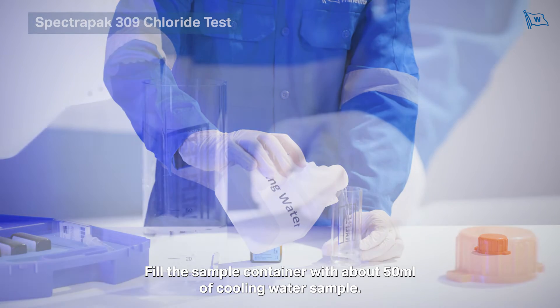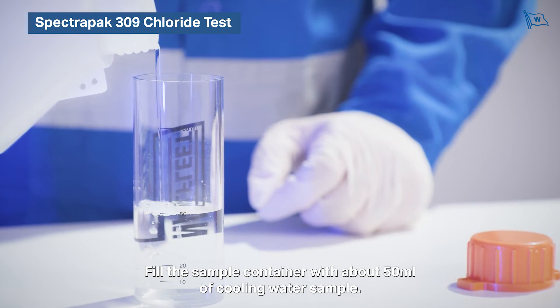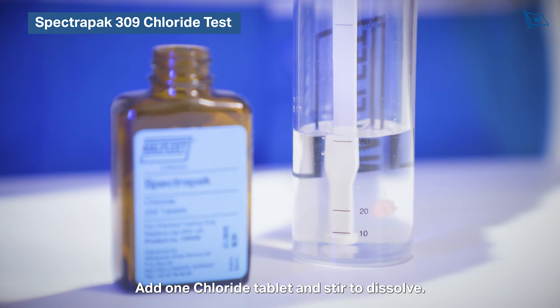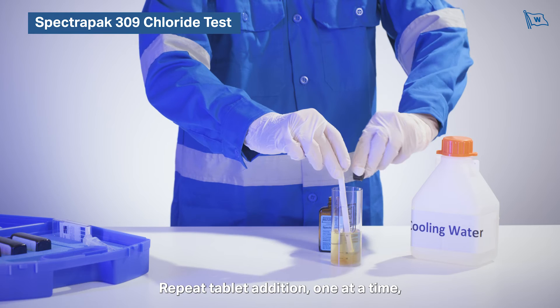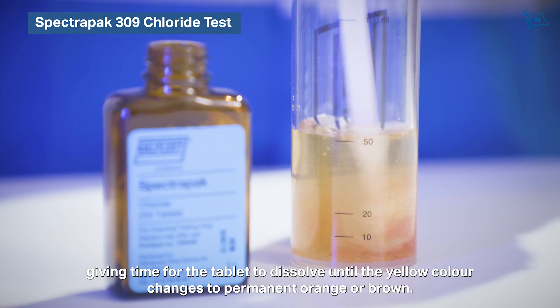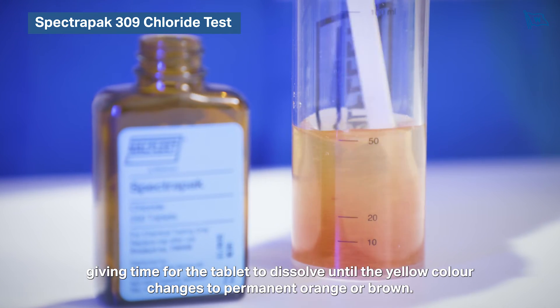Fill the sample container with about 50 millilitres of cooling water sample. Add one chloride tablet and stir to dissolve. The sample should turn yellow if chlorides are present. Repeat tablet addition one at a time, giving time for the tablet to dissolve, until the yellow colour changes to permanent orange or brown.